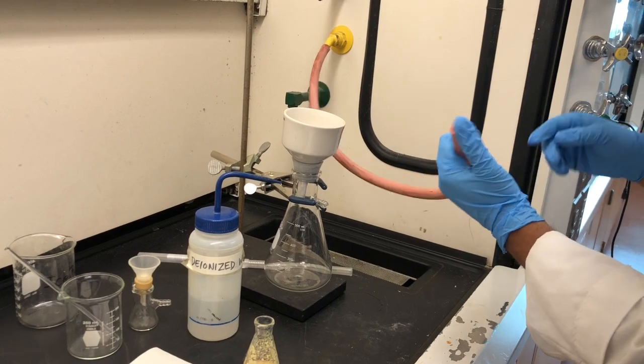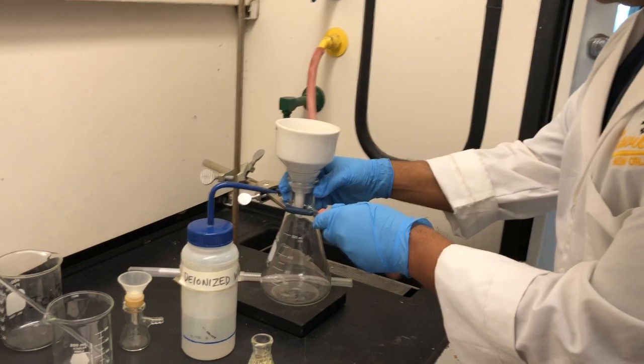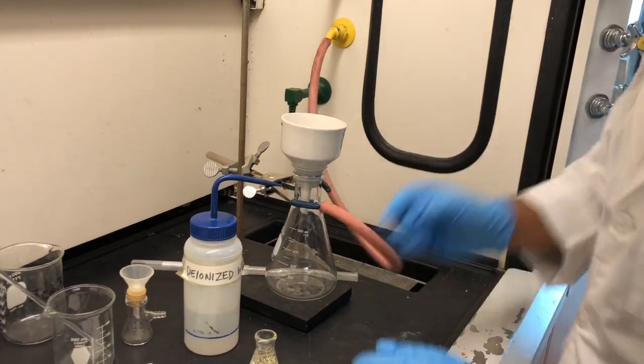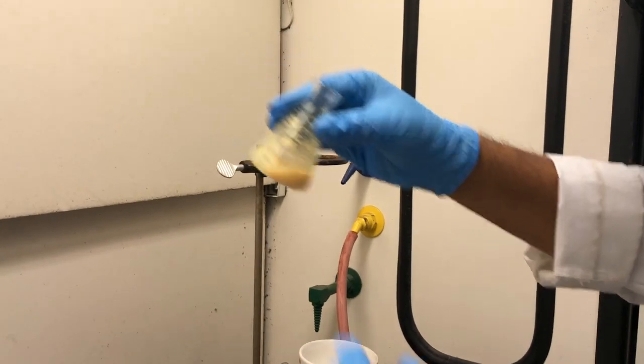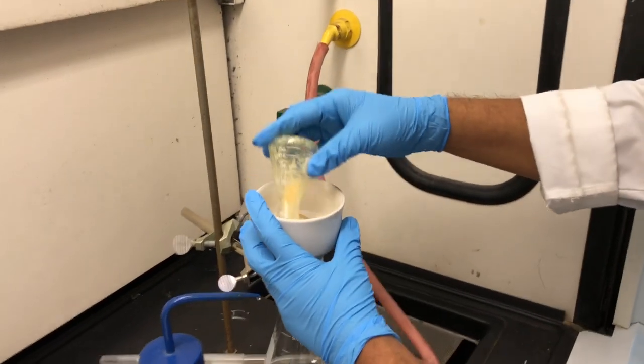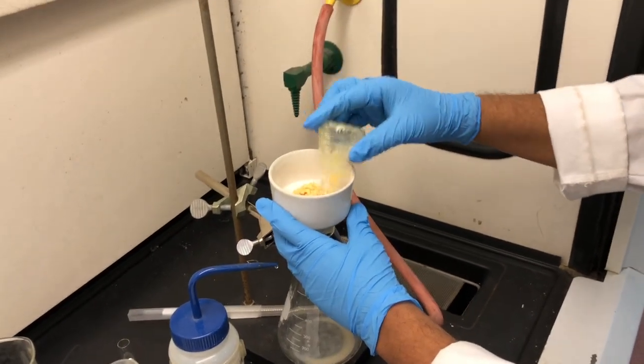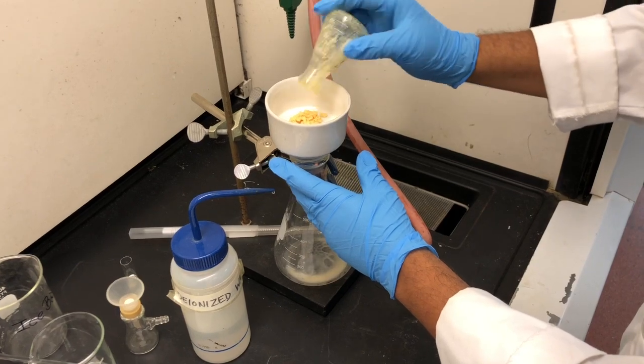And then you clamp it and you apply vacuum. Basically, you need to connect vacuum line to the filter flask. Then you swirl your alumina flask and you transfer all the solid on the filter paper. Now transfer. Try to take out the maximum amount of solid from the flask.